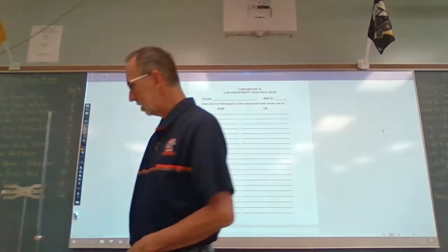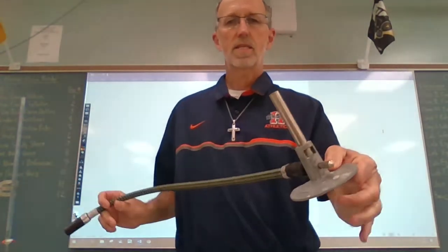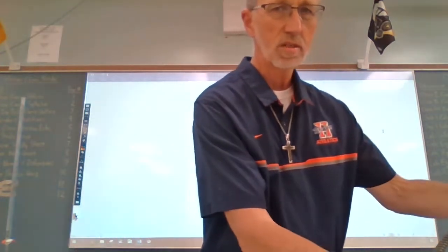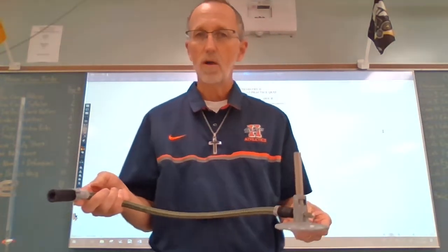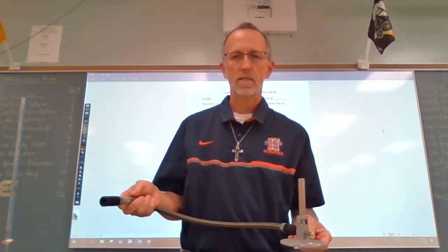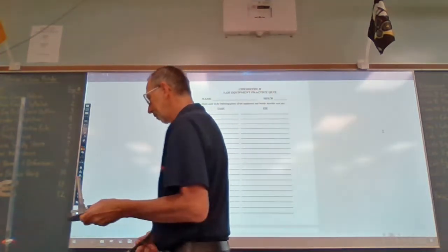Okay. Which brings us to the next one, which is a Bunsen burner. It's right here. This here is the Bunsen burner. This, of course, is the hose that connects it to the gas jet on your lab table. I will talk to you about lighting these and how to adjust them properly in our first lab. So the Bunsen burner is a flame. Obviously, using supplied gas, we use methane gas or what's called natural gas, and it's used, of course, for heating. Okay.